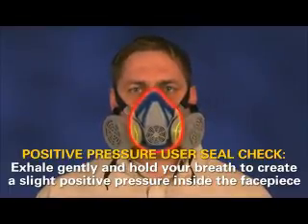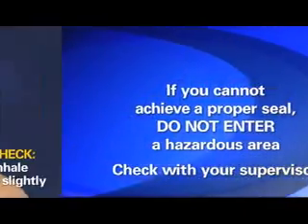If, on the other hand, you detect a face seal leakage, reposition the facepiece and readjust the straps, and then retest. If you cannot achieve a proper seal, you are not protected and should not enter a hazardous area. See your supervisor to determine what the problem may be.